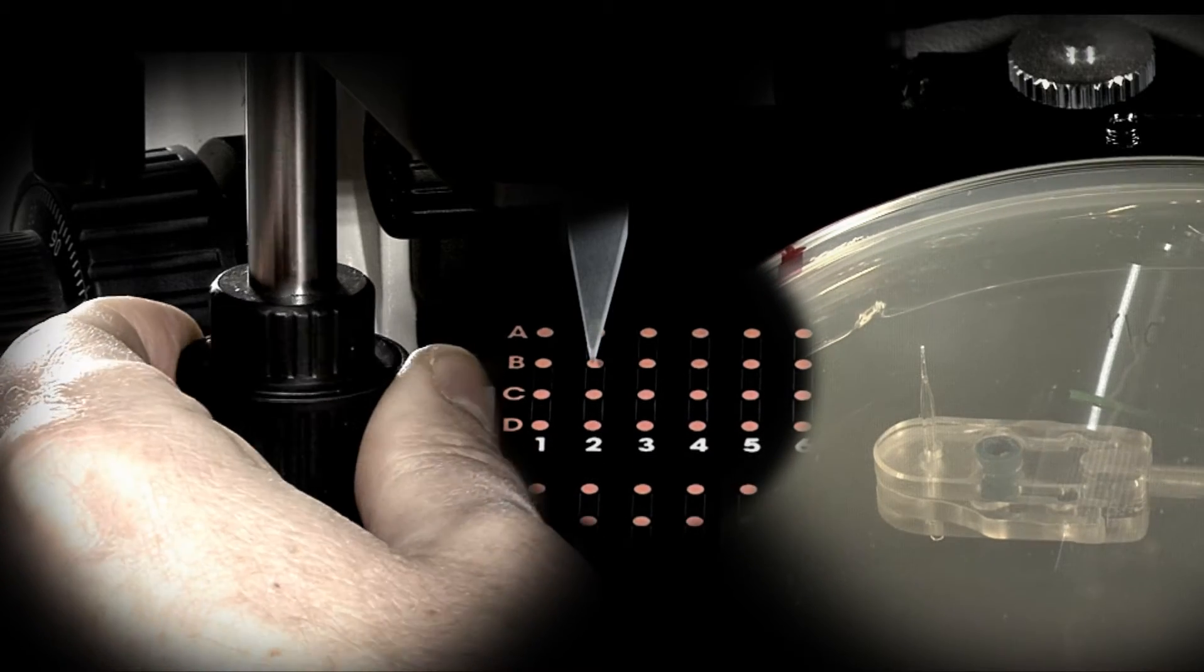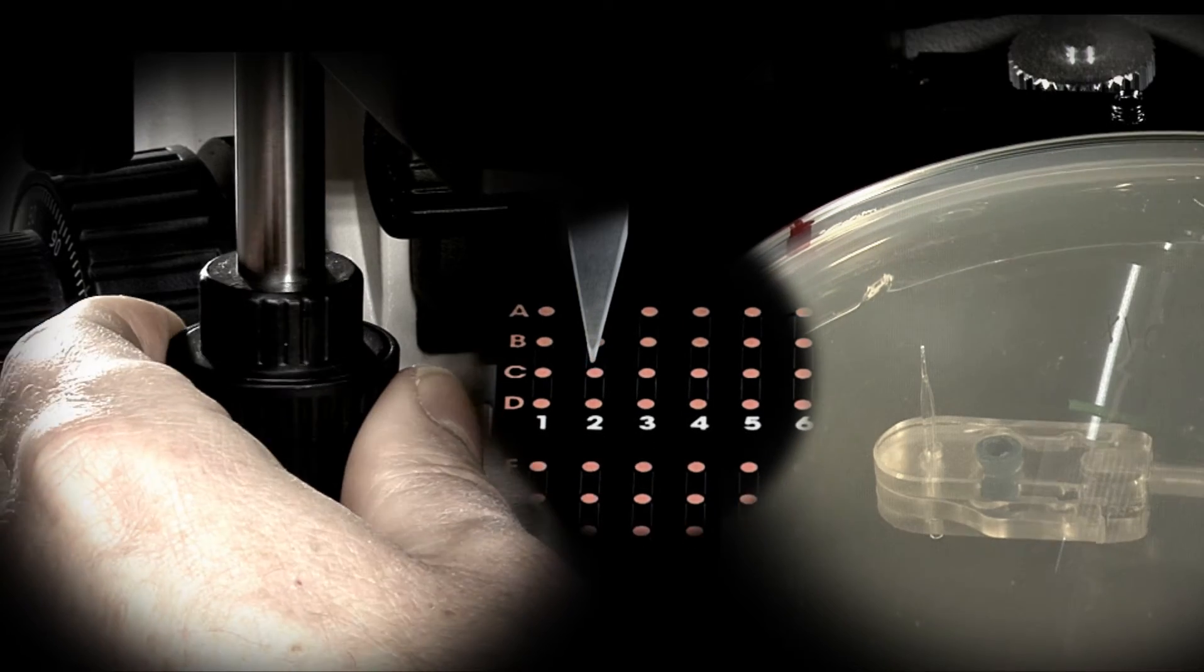Gridm, incremental click stops and index pointer as a positional reminder.